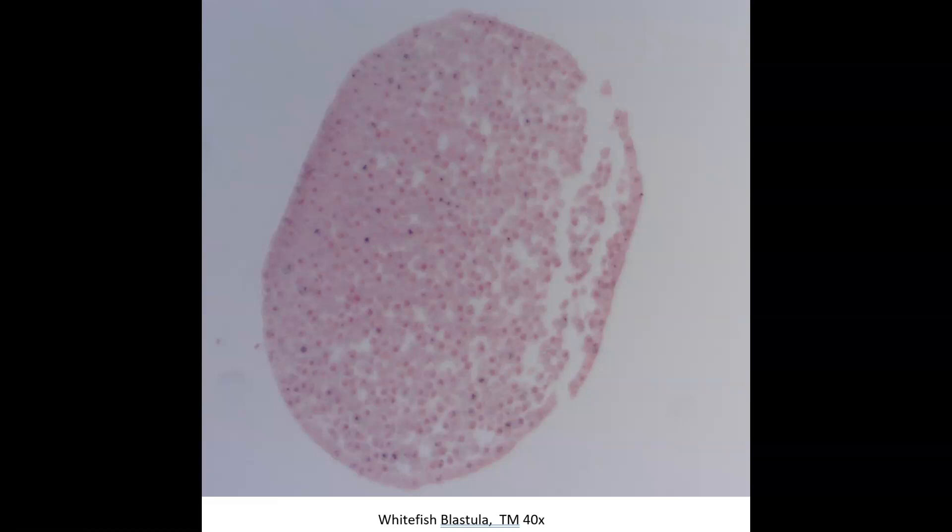Welcome to this magical tour of the whitefish blastula. Before we actually look at individual cells, I wanted to explain what a blastula is. It's a ball or group of cells formed in humans about 7 to 10 days after fertilization of the ovum by the sperm — about 100 cells. You can see different cells and nuclei here, but we can't see what's going on at this magnification, so we're going to magnify further and look at individual stages.